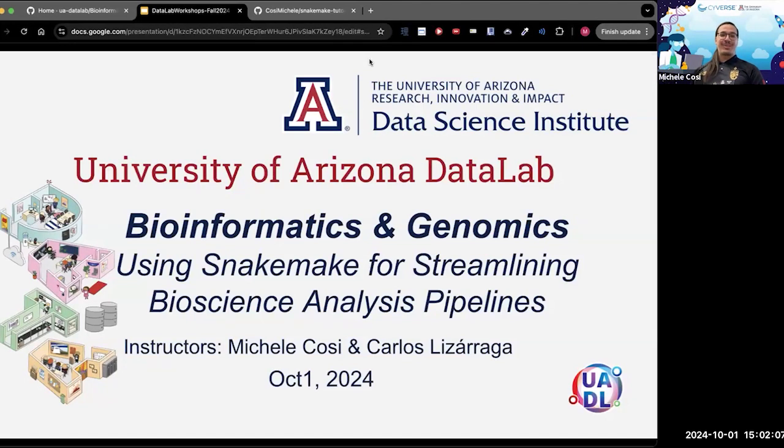Hello, everybody. Welcome to the Bioinformatics and Genomics workshop series. Today, we're going to be covering Snakemake as part of our exposition to pipeline managing tools.